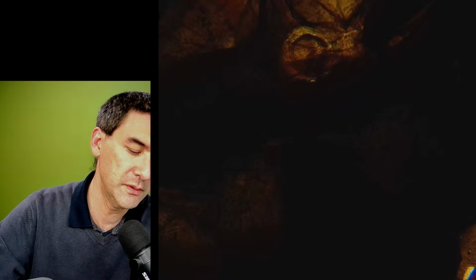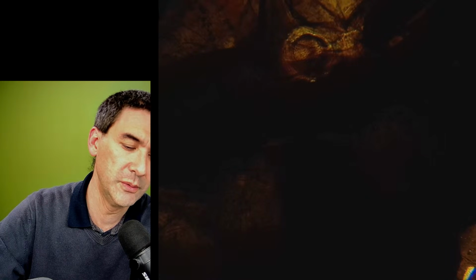Let me see. Okay, just a second. Where is this? So here we go. I'm going to try to go to automatic exposure. Okay, I think I'm just going to leave on the automatic exposure, even if this means refocusing.